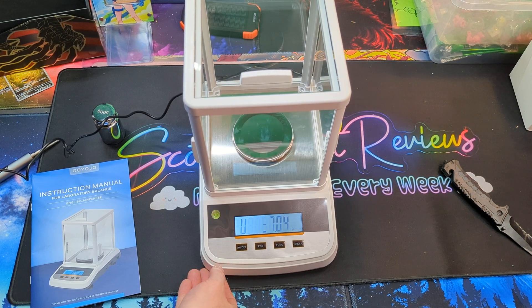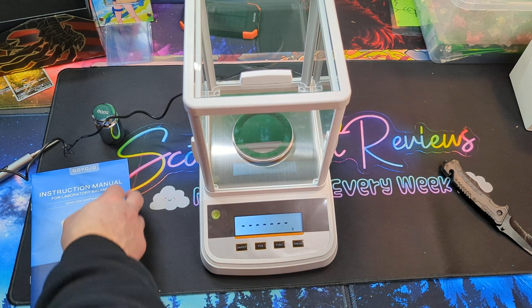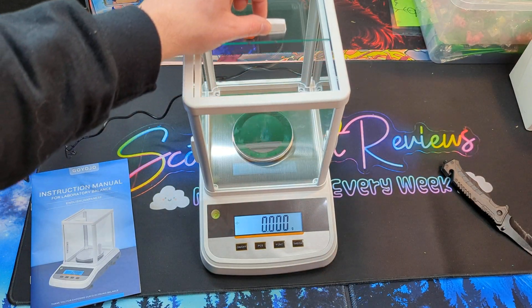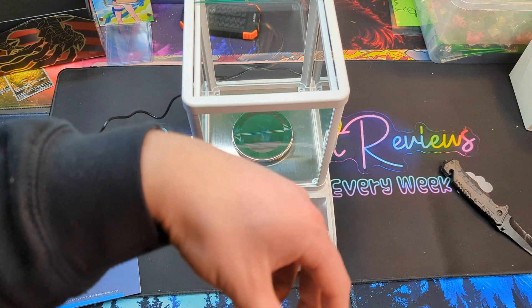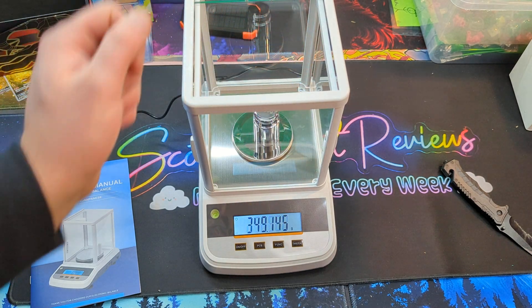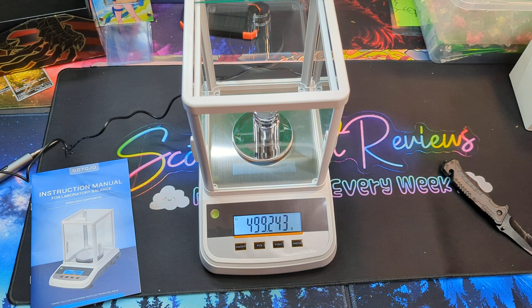Let's go ahead and turn it on so you guys can see — let it calibrate, we can do a test. It reads four hundred and ninety-nine grams.